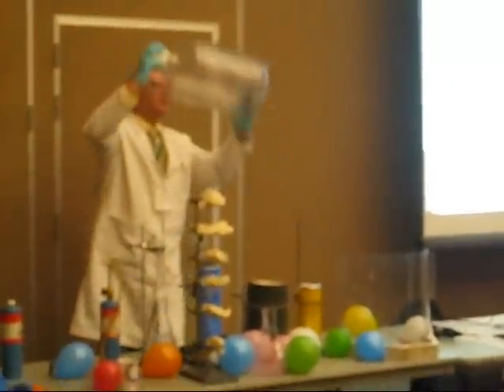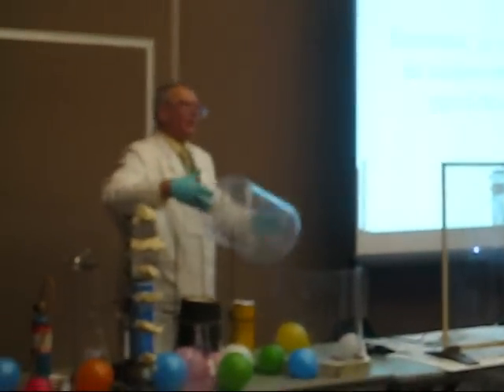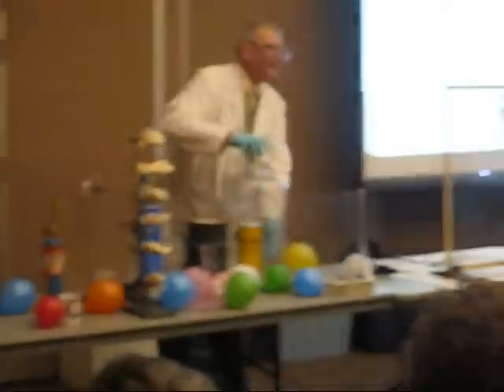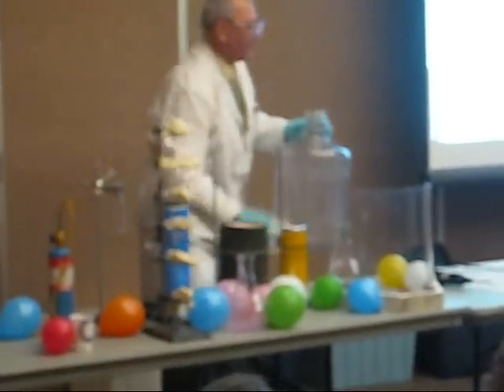You know, the incidence of explosion occurred when people used anhydrous alcohol. I mean, it can probably still explode with a little bit of water in the alcohol, but you want to lessen the chances of that, I would think. Get that excess ethanol out of there. We just want the vapor. We're doing vapor phase oxidations here.